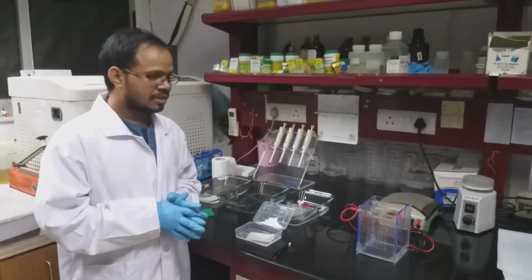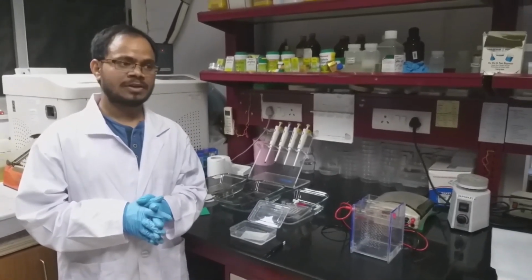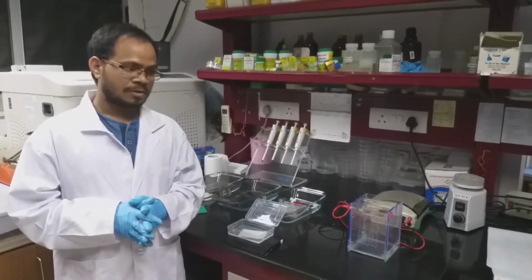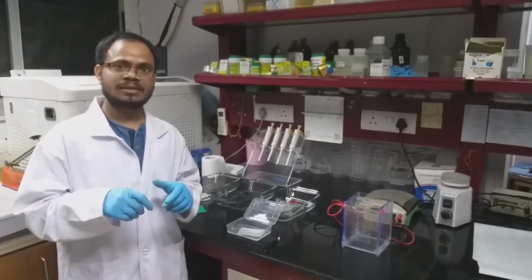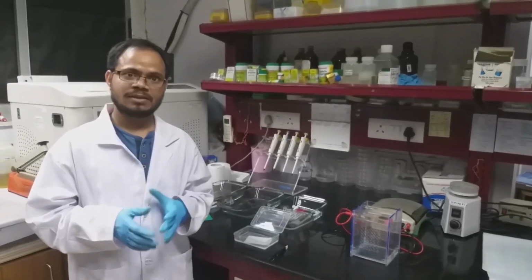So the processing for Western blot is different for nitrocellulose and PVDF. If you are using PVDF membrane, we have to cut the part. If you have ready-made pre-cut blots, then there is no need.